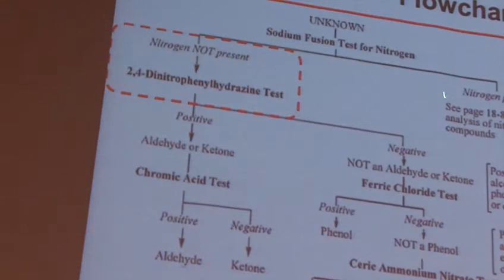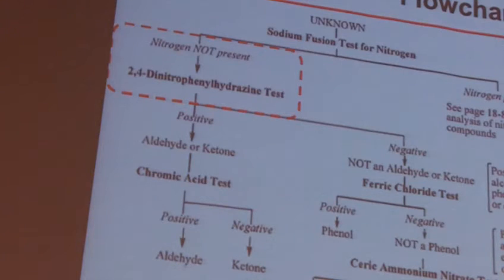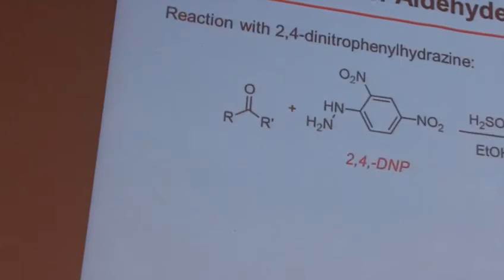If you have a nitrogen present, we go that direction. If the nitrogen is not present, that means you have one of those purely oxygen-containing functional groups. Note that some of the ones that have nitrogen do have oxygens as well. If we go this other direction, it does not have nitrogen, and there's only oxygen present in the functional groups. So if there's no nitrogen present, the first thing we do is the 2,4-dinitrophenylhydrazine test, the DNP test. As we learned last time, the DNP test told us about ketones.